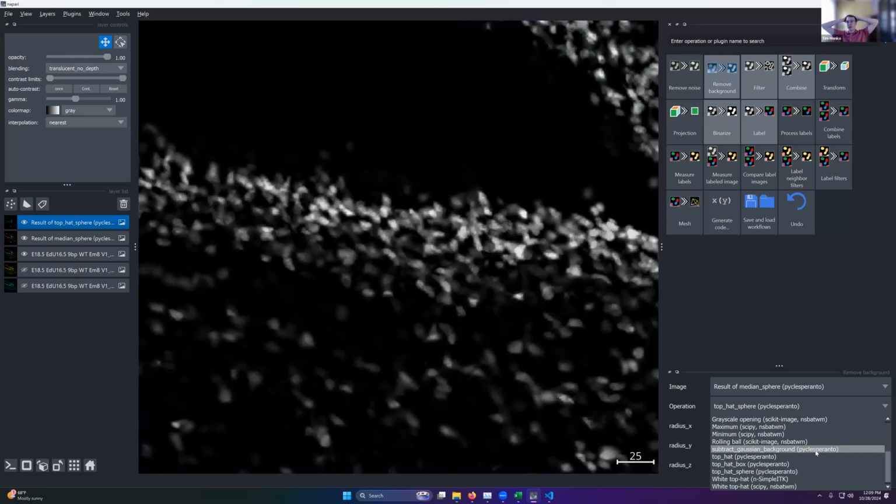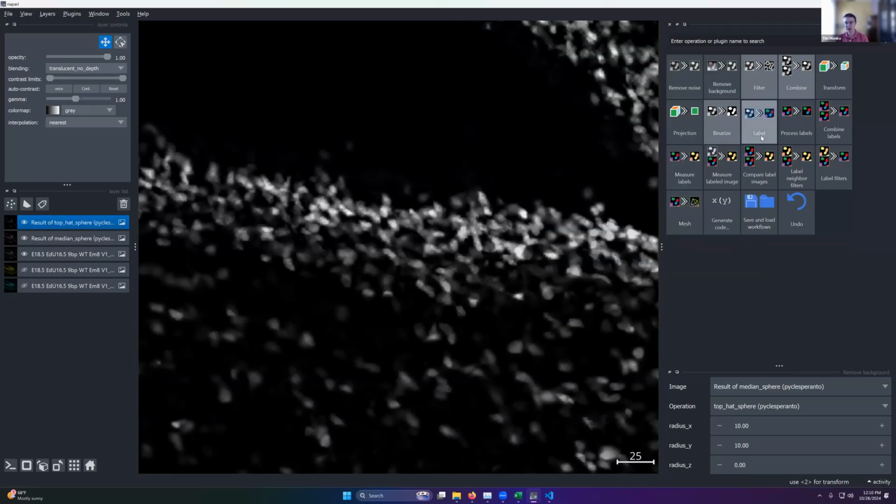We had a pipeline for 100 megabyte images, and it would take about 5 minutes per image on the CPU, and then it took I think like 15 seconds on the GPU. It was a lot of steps, but obviously that's the difference between days and hours for a high throughput workflow. So then finally, we want to click the label button.